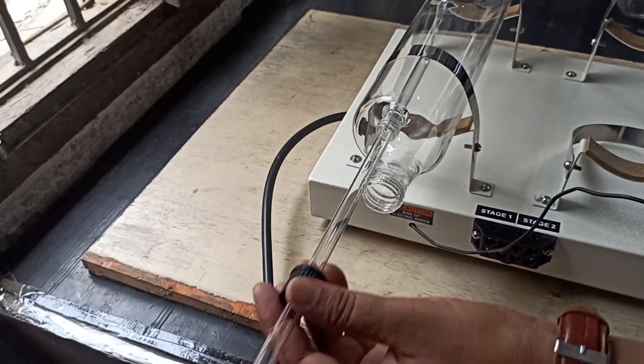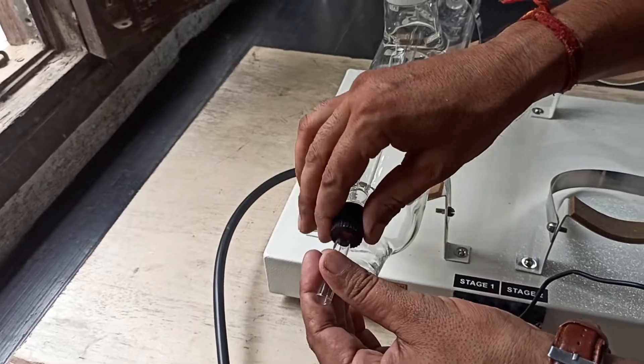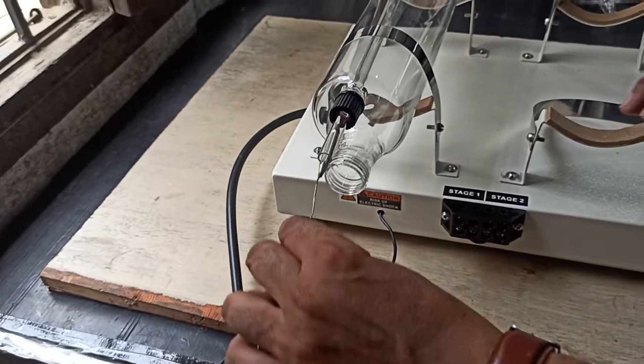Put the sensor probe into the sensor support glass tube and insert the sensor support tube into the first stage boiler.